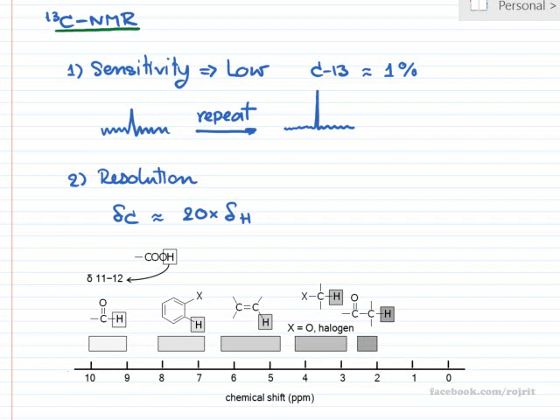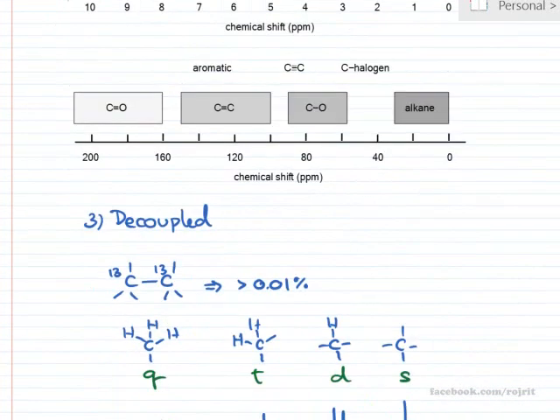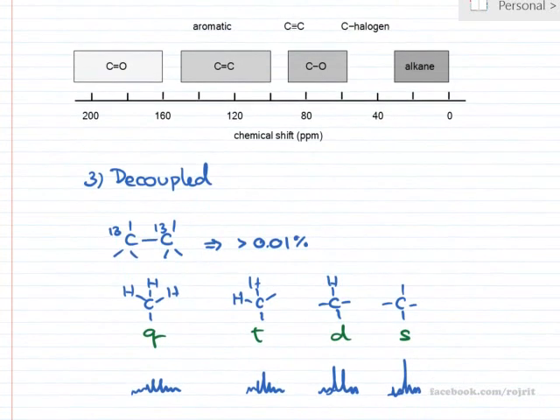But as I said, if it is coupled, everything is reduced, the signal peak height is reduced, right? And because the sensitivity is very low here, if the peak height is reduced down, then it would be mixed with the noise, right? And we cannot tell whether that is the actual signal or the noise, right?